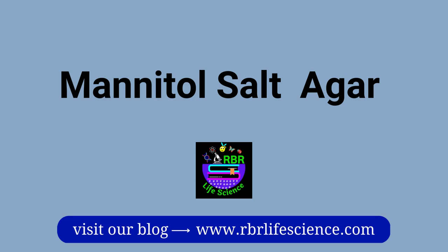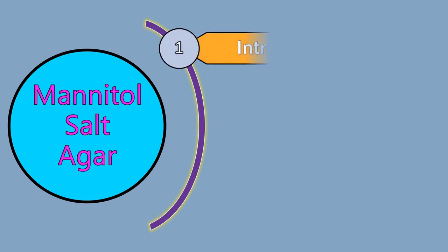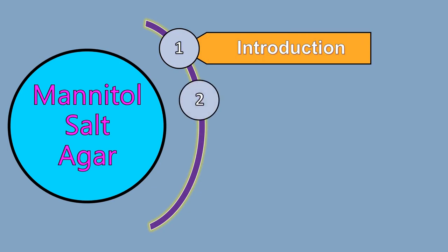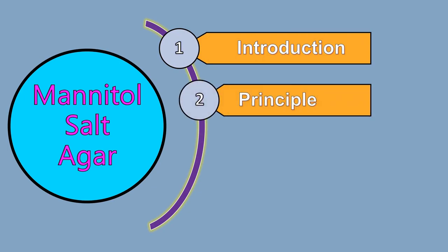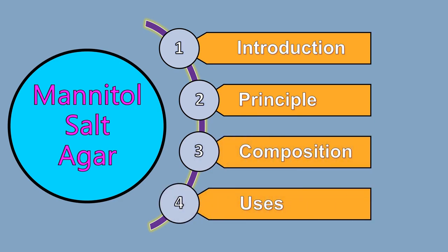Hello everyone, welcome to RBR Life Science. Today we are going to discuss about mannitol salt agar. After watching this video, you will be able to understand the introduction of mannitol salt agar, the principle of mannitol salt agar, and the composition and different uses of mannitol salt agar.